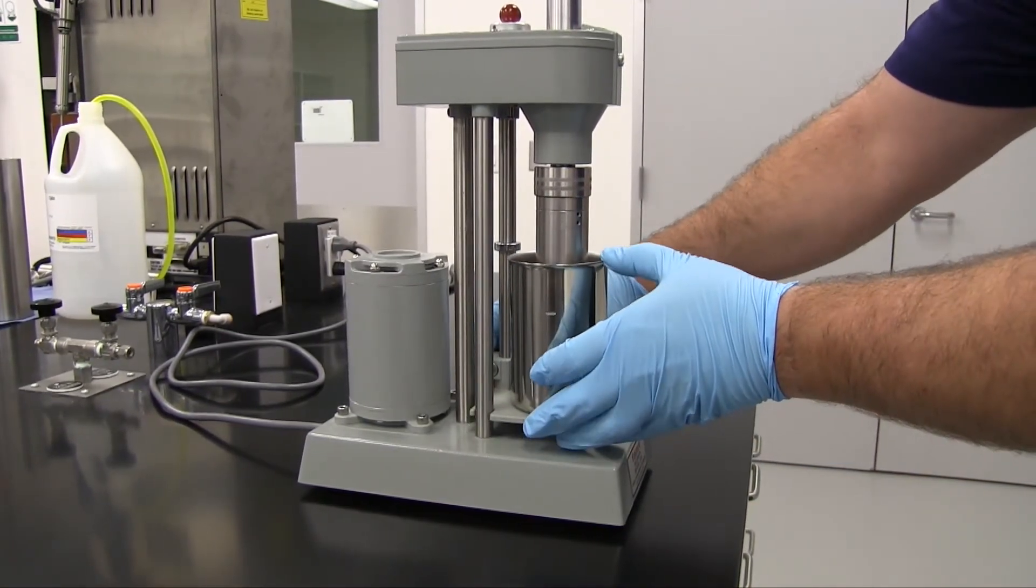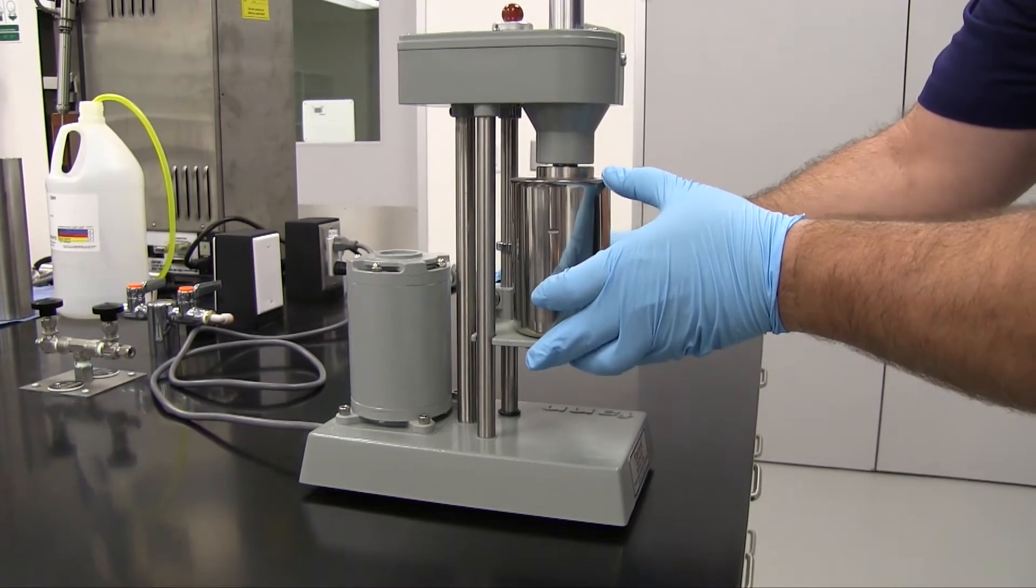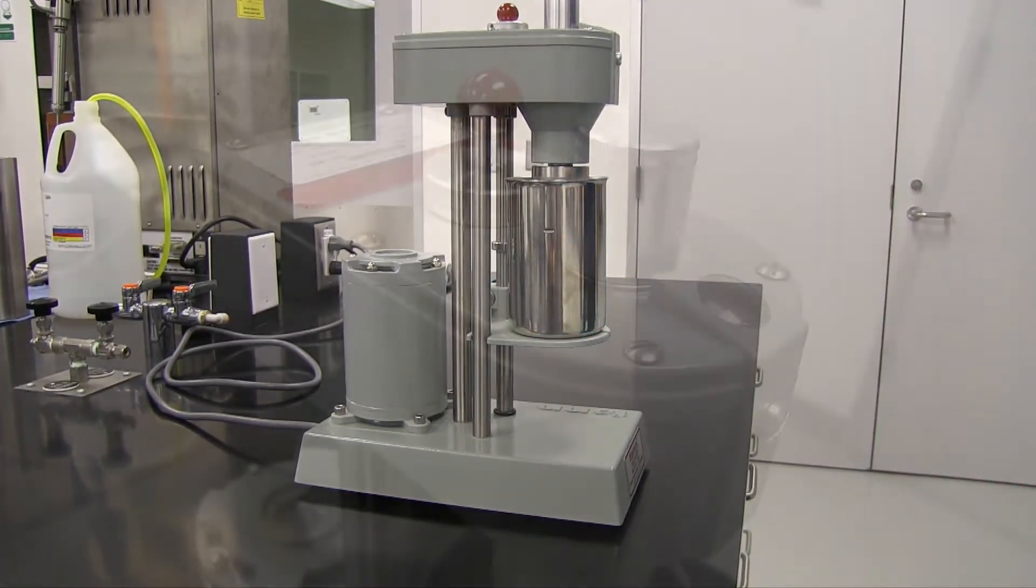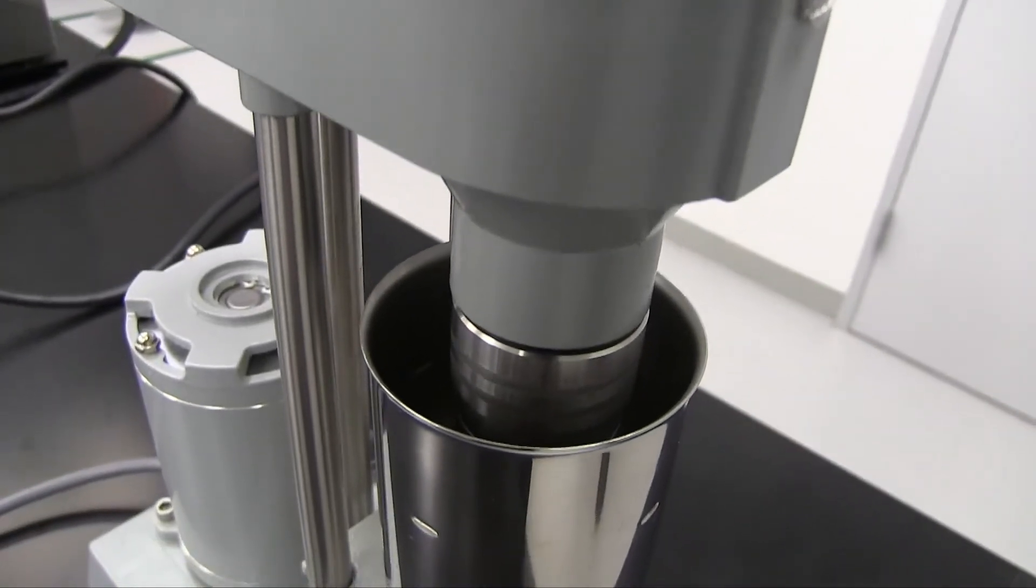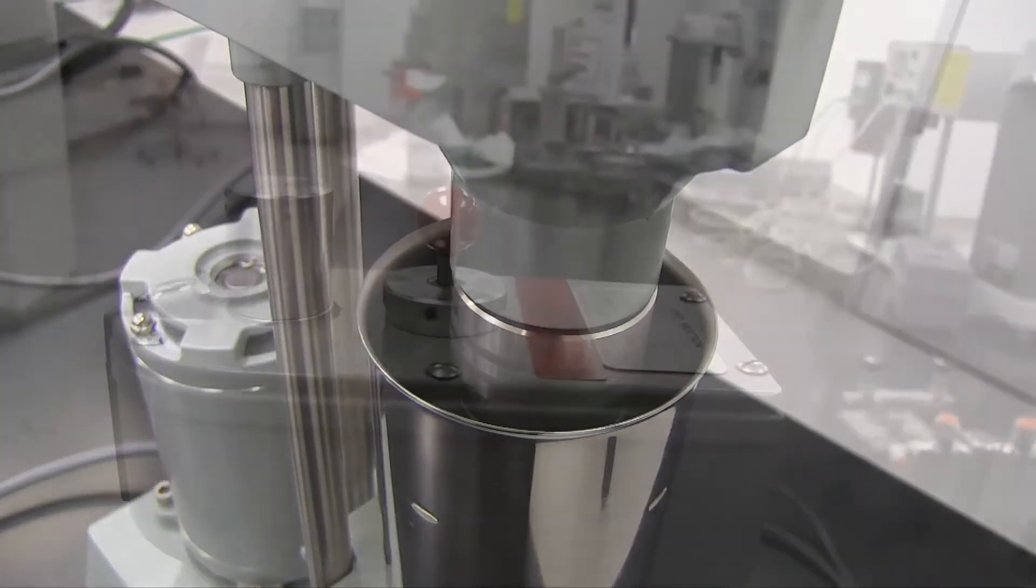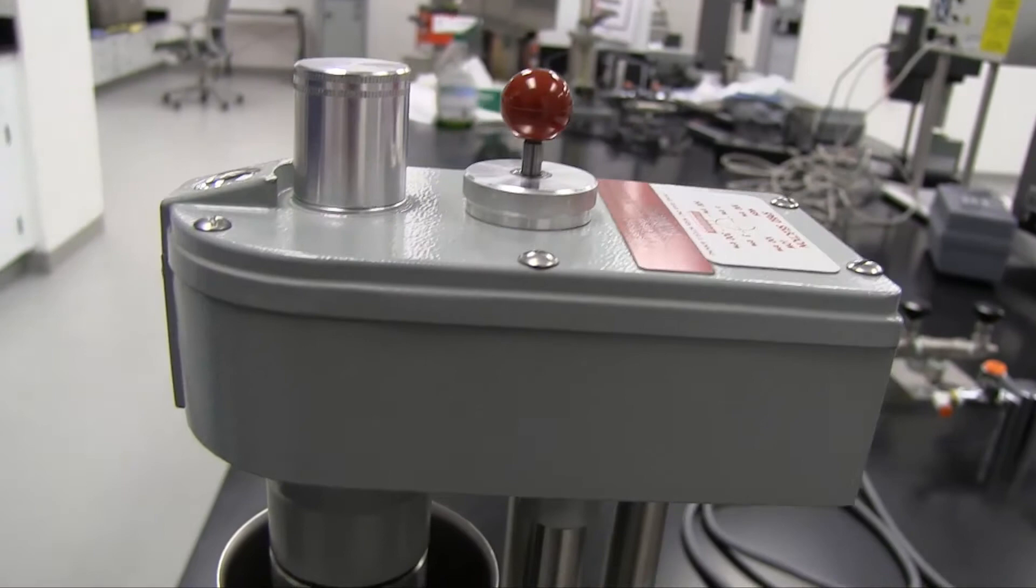A measured sample of fluid is placed in the cup and the stage is raised, lifting the cup. Precision gearing allows the rotor sleeve to rotate at known speeds. The viscous drag exerted by the fluid creates a torque on the bob.